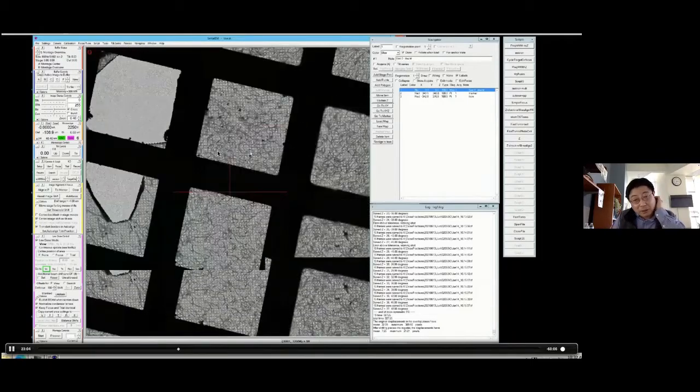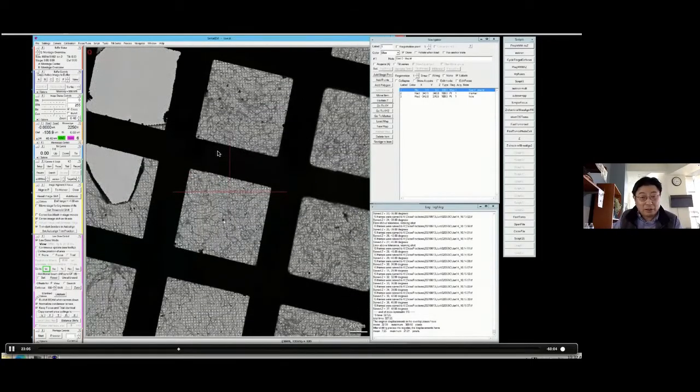And in this particular grid, some areas are very, very dry, for example, like this area. So this is one area. We call it test, just to see what this sample looks like. So then I go here, go to XY. So we'll go to this location called number 4 coordinate.